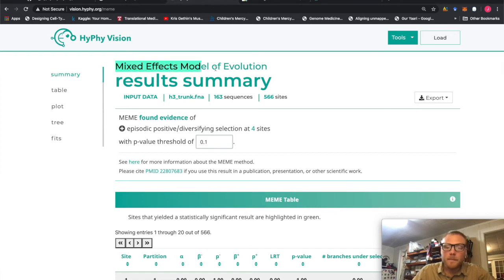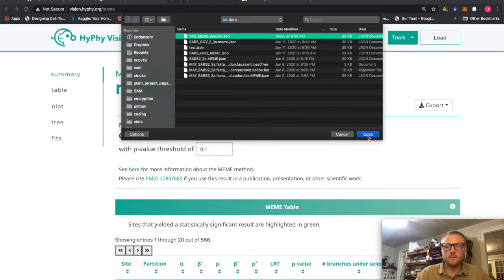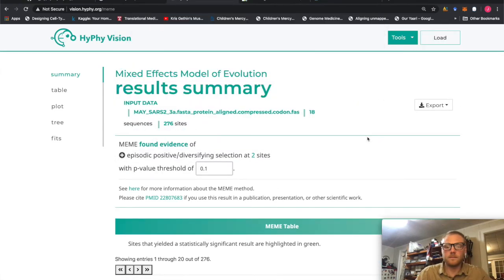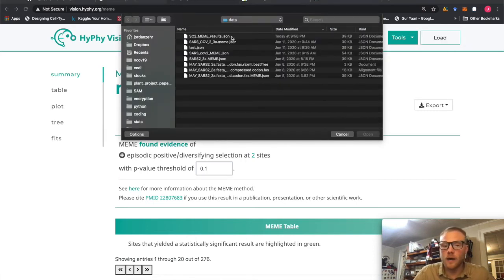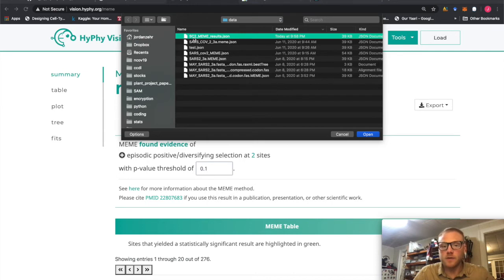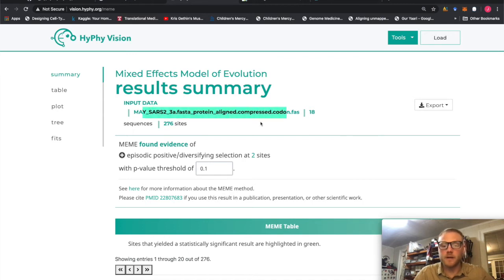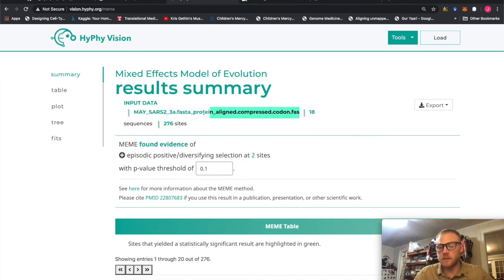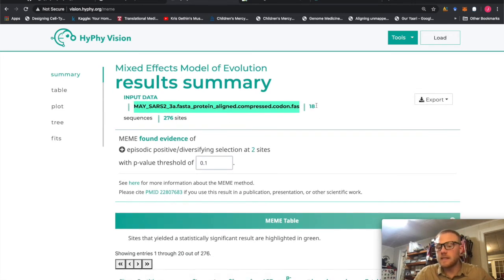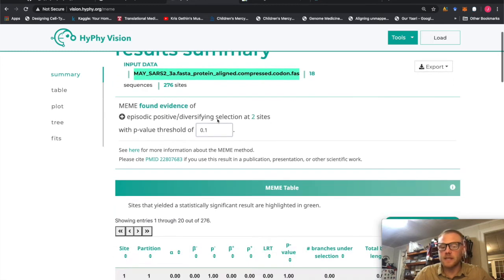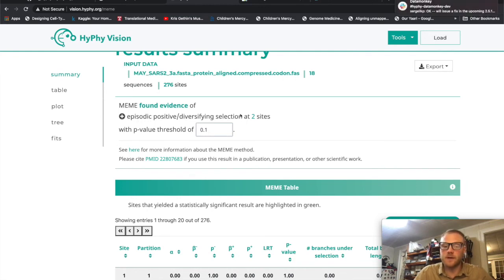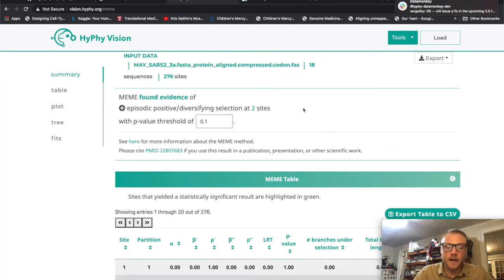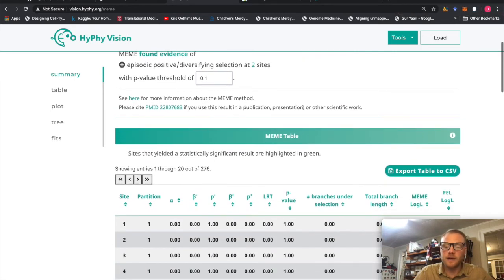So as you can see, MEME, I'm looking at MEME right here. Let me load my one. So what we're going to do is we're going to load our MEME JSON. So SARS-CoV-2 MEME results dot JSON, I'm going to open that up. And boom, here you go. So here is the codon-aware multiple sequence alignment that we actually put in. You can tell that there were 18 sequences with 276 sites that were tested. And two of the sites were found evidence of positive episodic diversifying selection. So this is great. We now have a way to visualize the actual data that we're seeing.